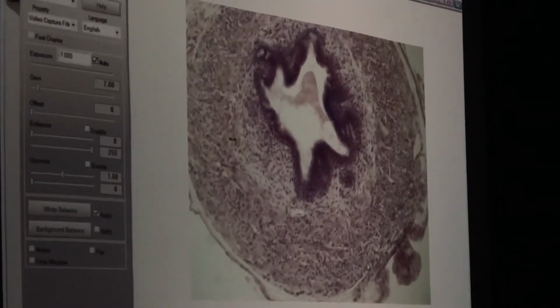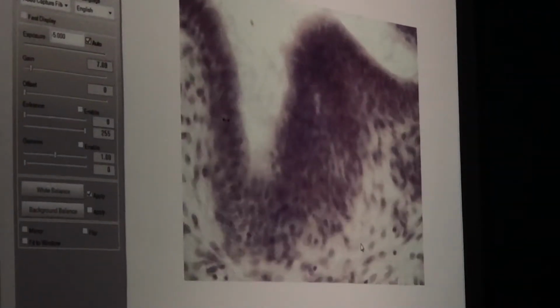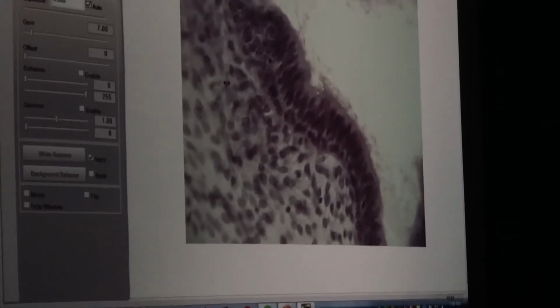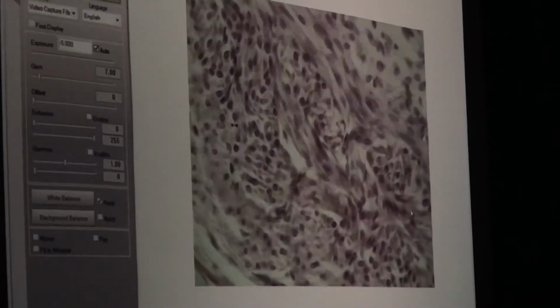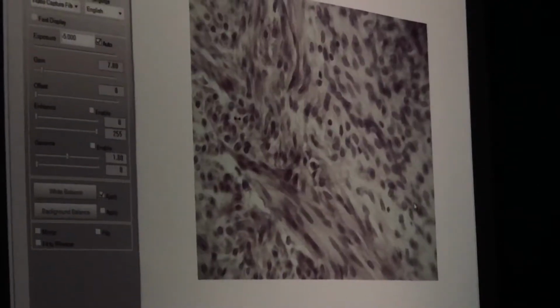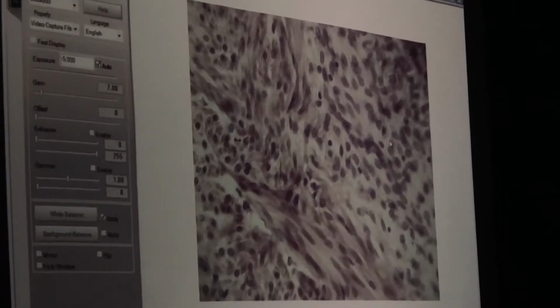All right, so let's look at the tube itself up close and personal. What kind of epithelium are we supposed to see on here? Pseudostratified. This definitely looks pseudostratified to me, don't you think? Multiple fake looking layers, definitely tall cells here, right? And then what else should we see on the vas deferens? Smooth muscle? Yeah, so if we look, there's a muscle layer in here. This muscle is pretty distinct looking. This stuff, maybe not so much.